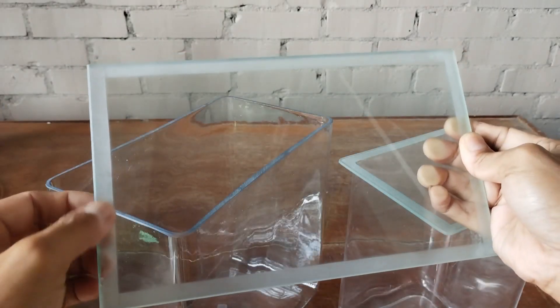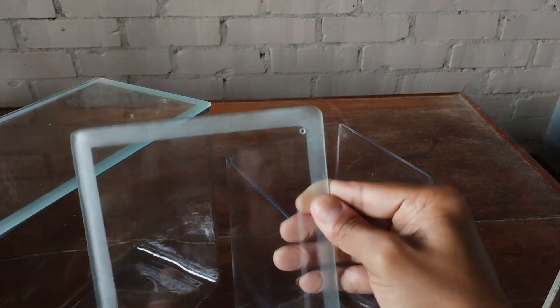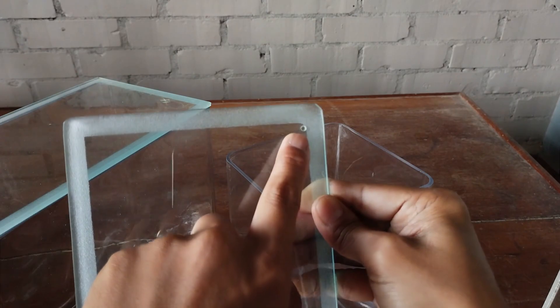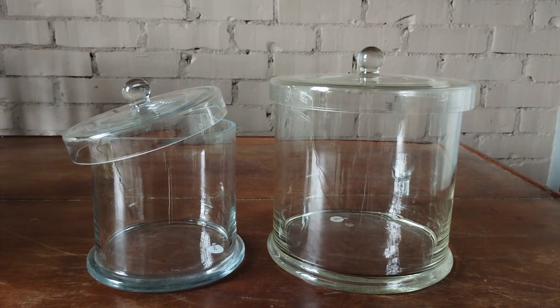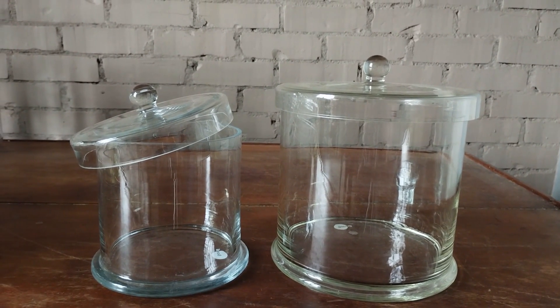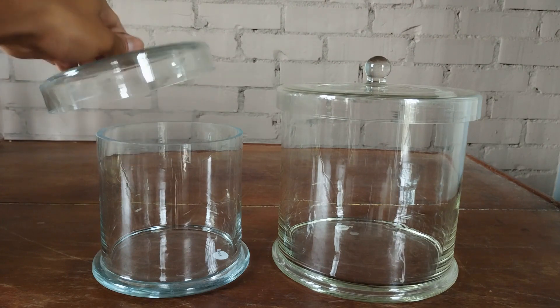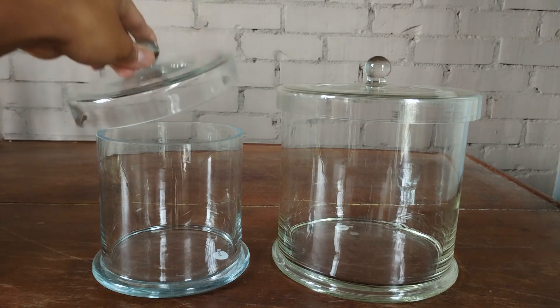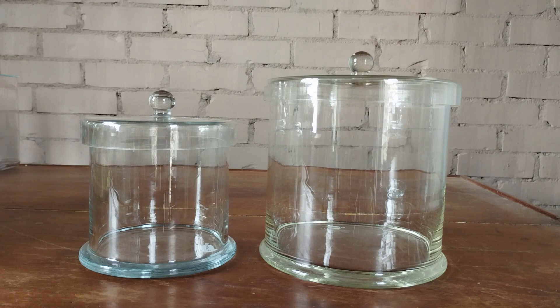The glass lid usually has frosted edges for a tight seal. Some lids are also designed with a tiny hole to facilitate refill and drainage of the preservative fluid. Cylindrical museum jars usually have a kettle lid with a knob-type handle on top. They also come in different sizes — the larger one being 20 cm diameter by 20 cm height and the smaller one a 15 by 15 cm size. Cylindrical museum jars are great for storing and displaying specimens with an overall bulky or rounded shape, such as brain and other organ specimens. Even snakes preserved in a coiled posture pair well with cylindrical jars.